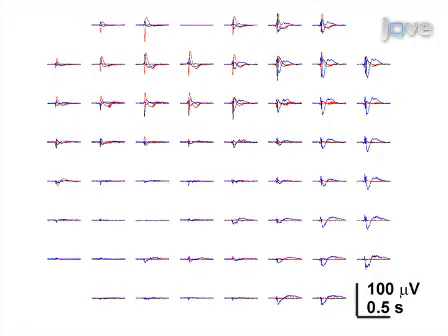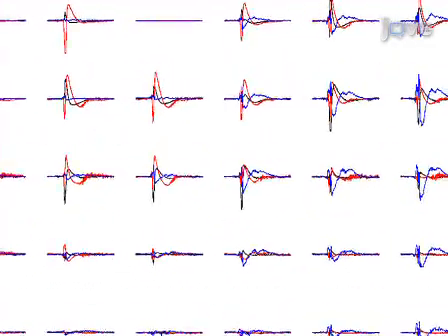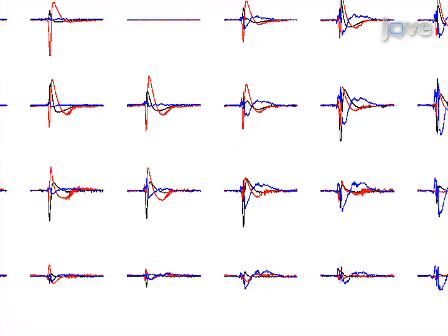Activity on the MEA tends to emerge in spatiotemporal clusters, with activity at one electrode often accompanied by activity at other sites at the same time. Typical waveforms of the LFP during such activity periods are shown here, by overplotting 3 clusters occurring several seconds apart. For each cluster, negative LFP deflections can be seen at several electrodes within a window of 1 second.